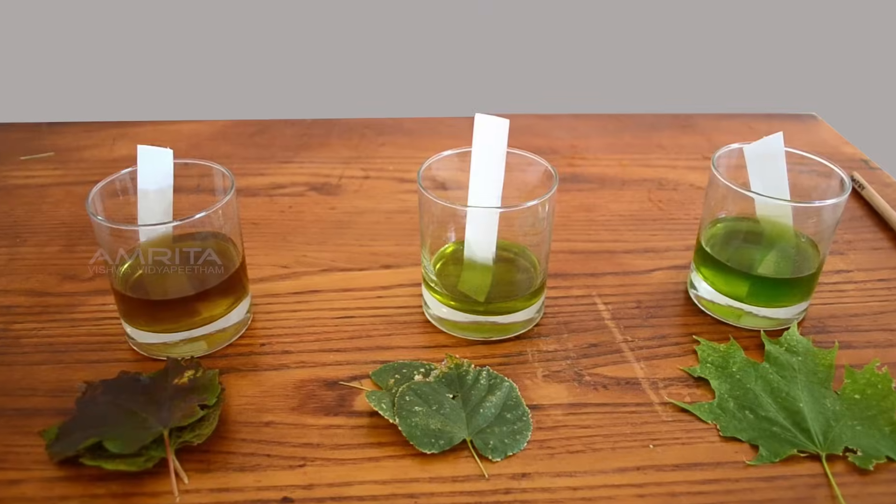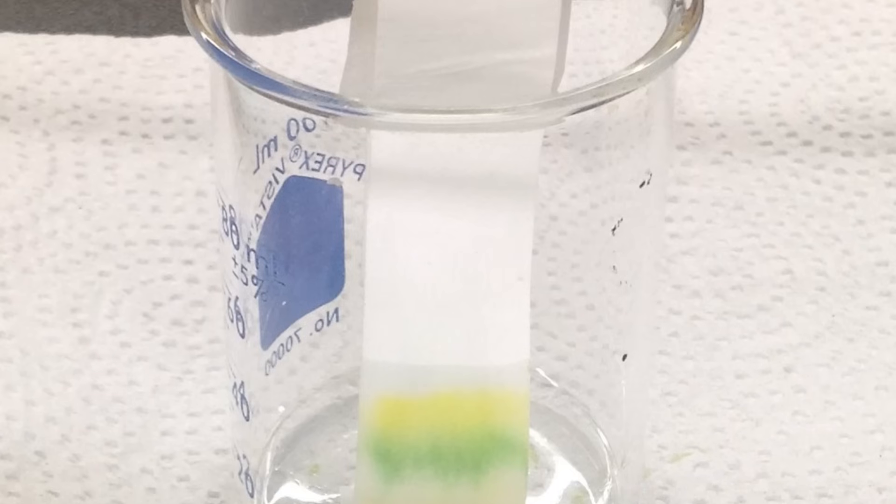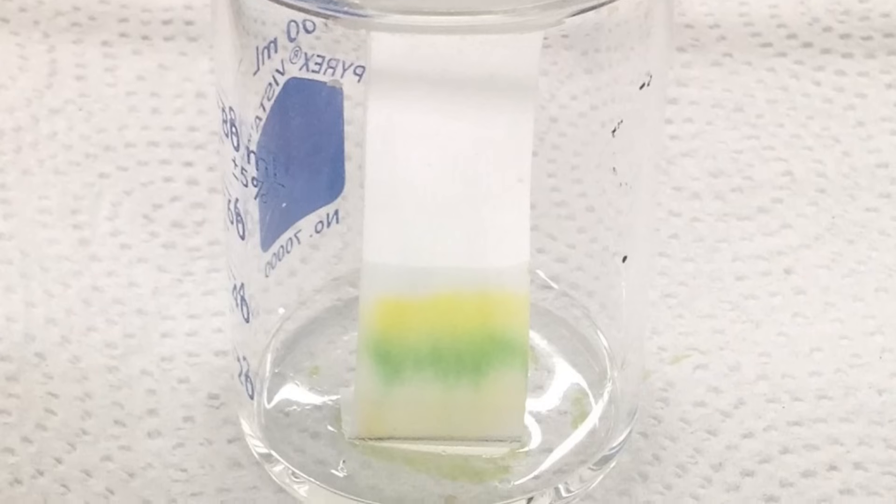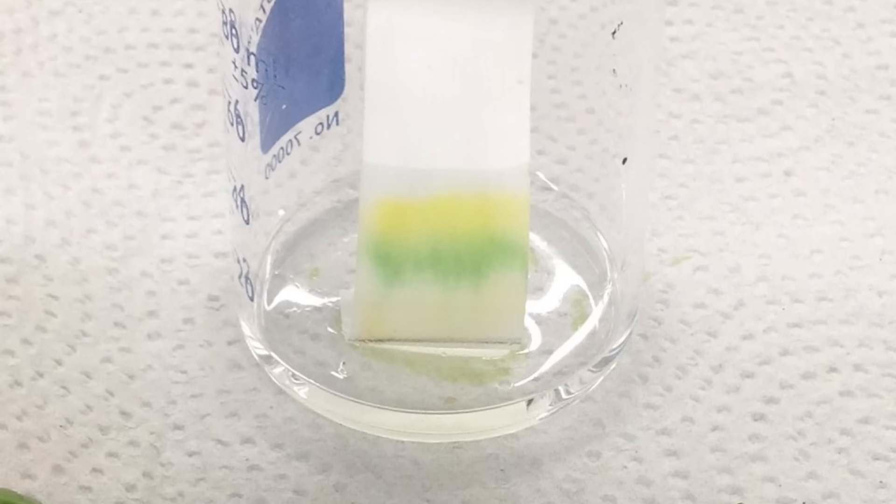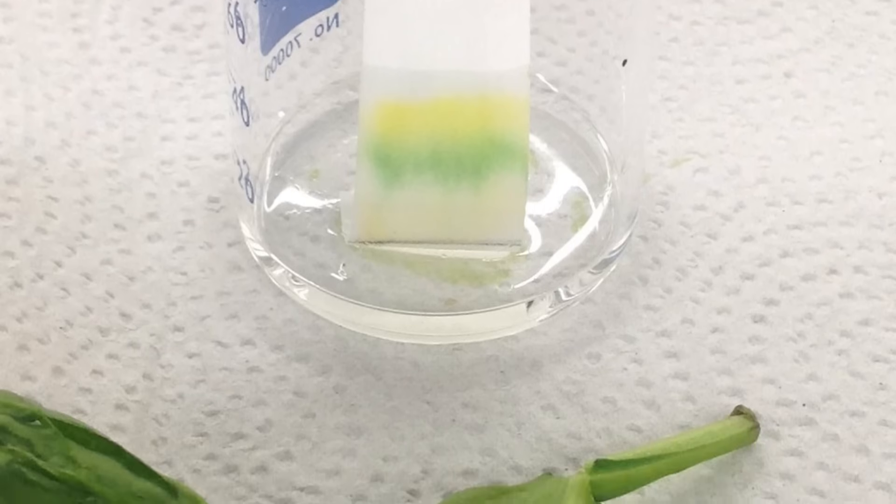Paper chromatography is an analytical method used to separate coloured substances, especially pigments. In paper chromatography, the sample is distributed between a stationary phase and a mobile phase.